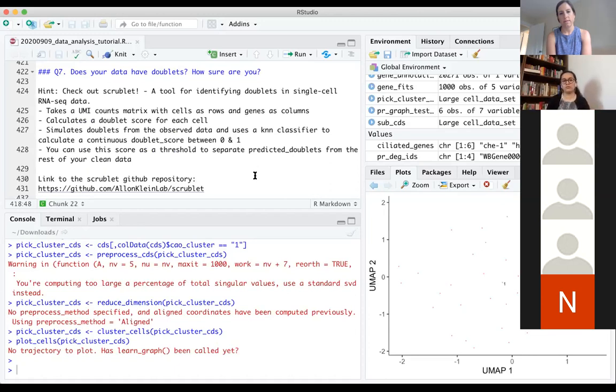So we have looked at other doublet removal tools, and there's no good or bad here, but we realized that the performance is similar across 3 or 4 tools, but the speed varies substantially. So Scrublet is a good combination of both, so we decided to go with that.